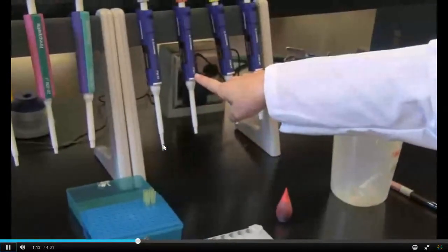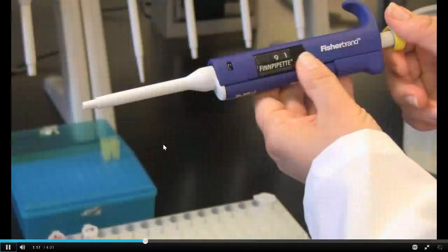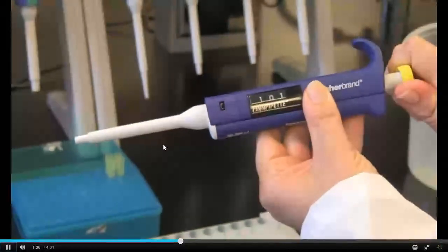Micropipette volume capacity will generally be written on the side of the micropipette. For our demonstrations, we will micropipette 100 microliters of liquid using the 20 to 200 microliter pipette. Set the micropipette to 100 microliters. Be careful to ensure you have the correct micropipette and that it reads 100 on the side.